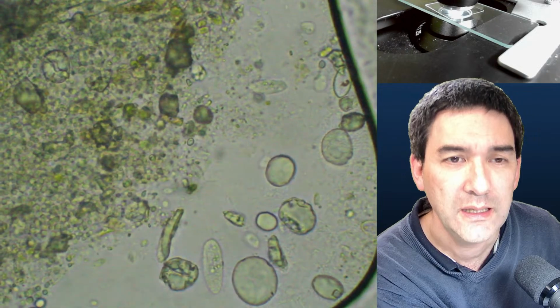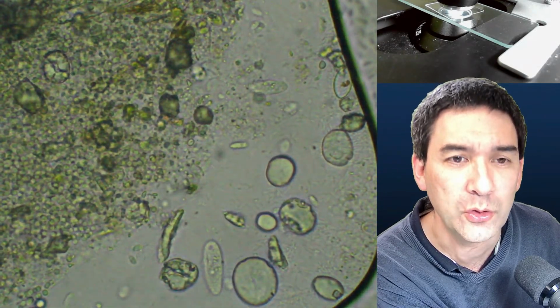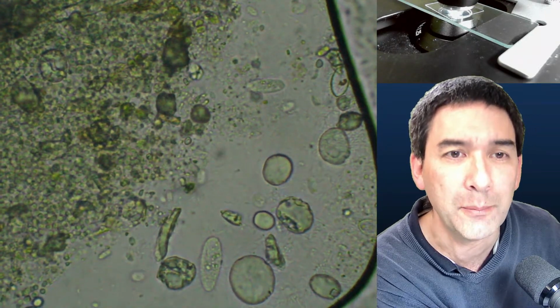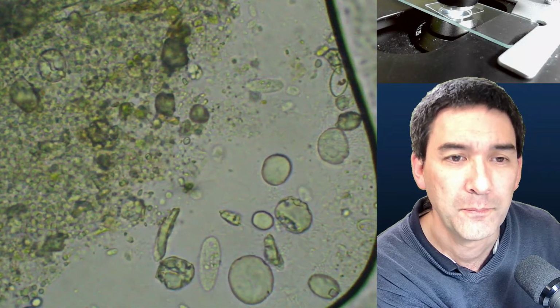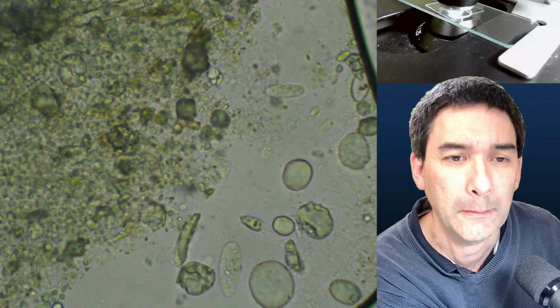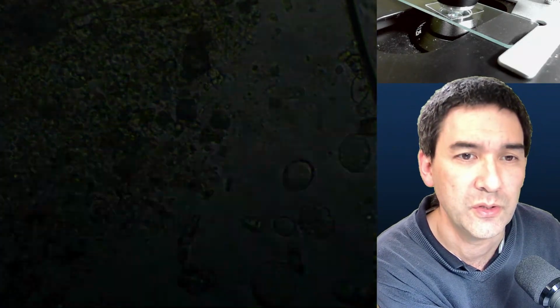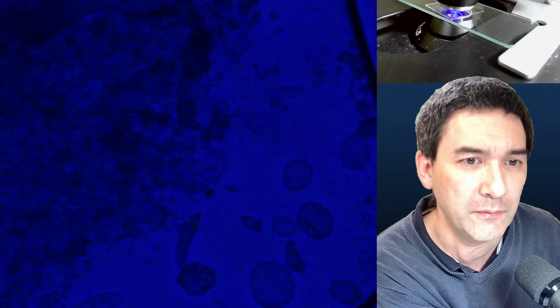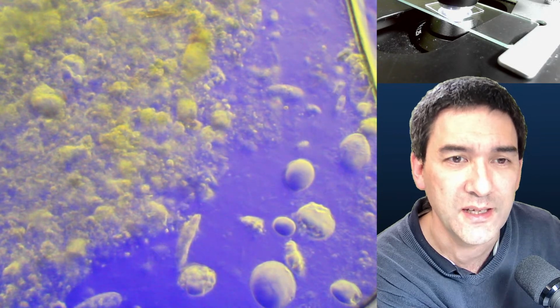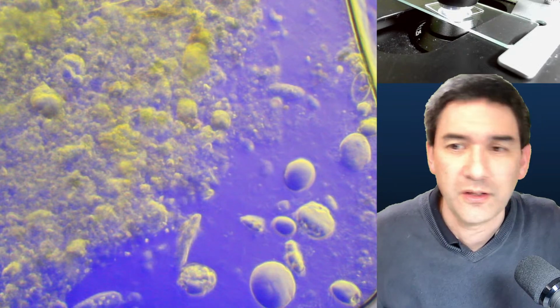Okay, it does look more crisp and sharp now because I'm closing the condenser, and therefore you're increasing the contrast, of course, and also the depth of field. And therefore it gives you a subjectively more crisp look. But again, if you want to use colors, then you use the filter again, and I have to turn up everything, and open the condenser, and then I have something like this again. Okay, so just for comparison here.